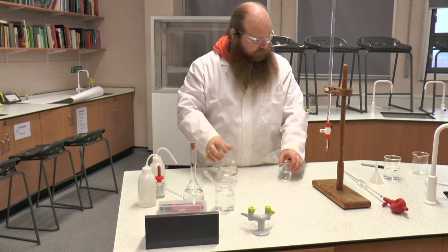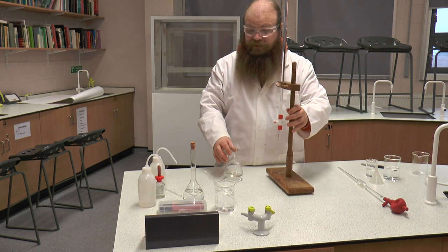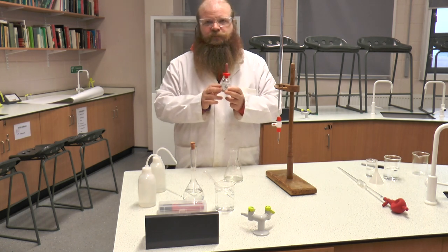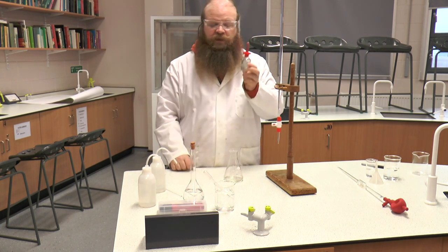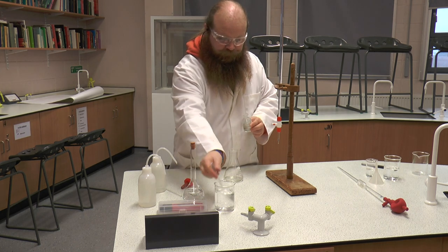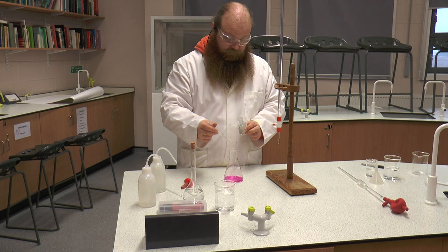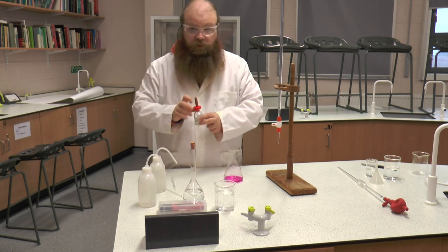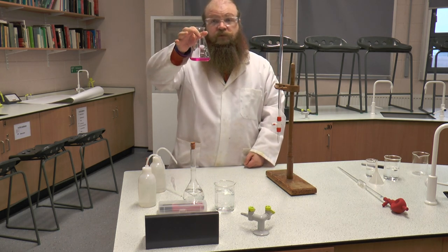We have our sodium hydroxide, which you'll notice is in a small laden beaker, and we have our hydrochloric acid. Now we're going to determine the end point of this practical using an indicator. The indicator we're going to be using is phenolphthalein. This is an indicator that has two colour states — one is a clear colourless, and the other is a bright pink. We're going to add a few drops of phenolphthalein into our solution. I've added five drops; there is no need to add more. The indicator is very sensitive and, as you can see, has turned this solution bright pink, because it is an alkali.